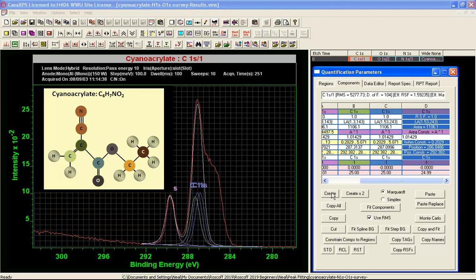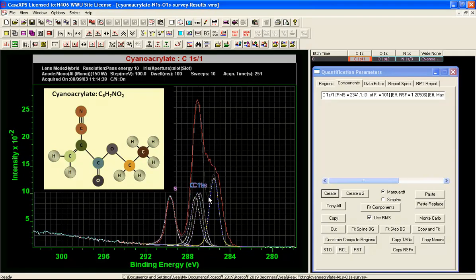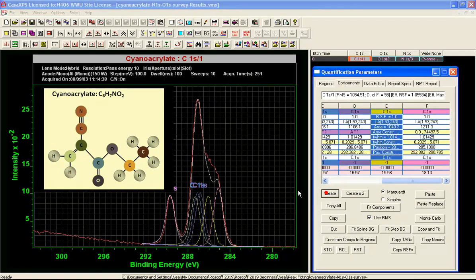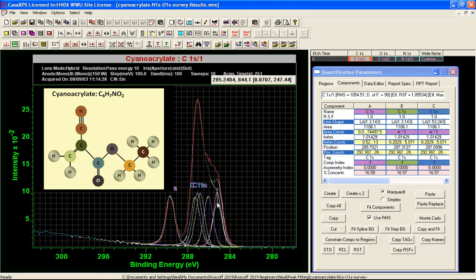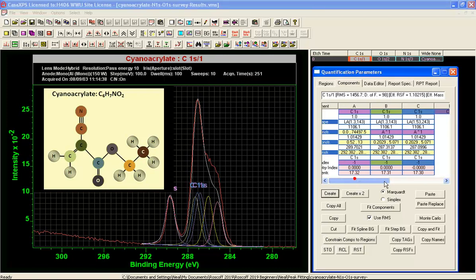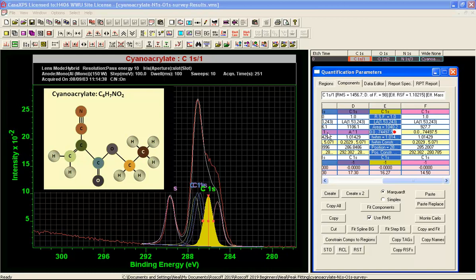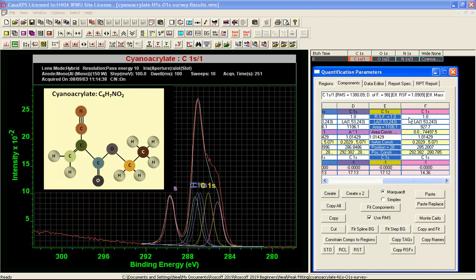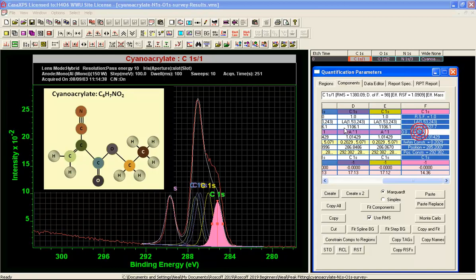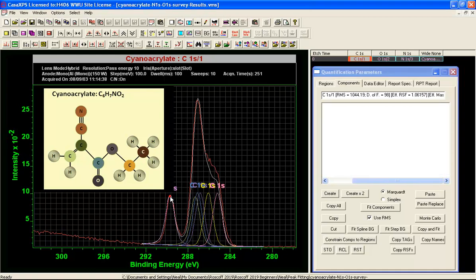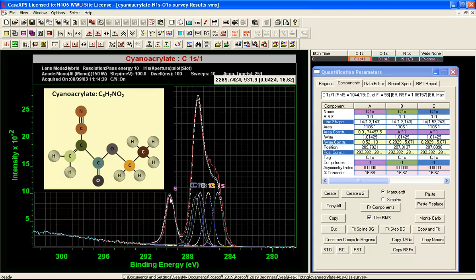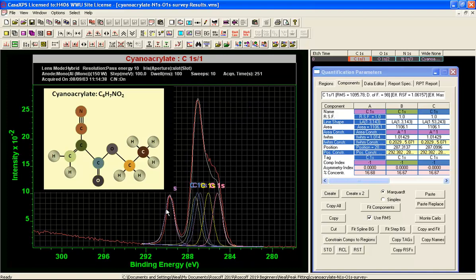So we'll add two more peaks. And these two peaks, once again, all should be the same. So we'll say A star 1, A star 1. So the peak that is controlling all of these peaks in terms of intensity is this first peak that stands all alone.